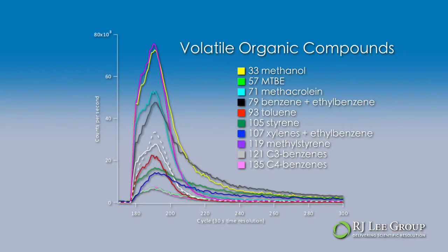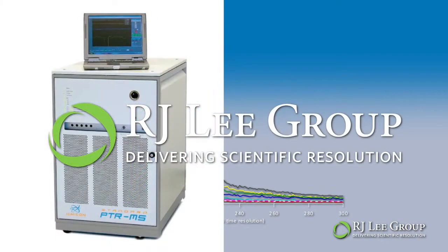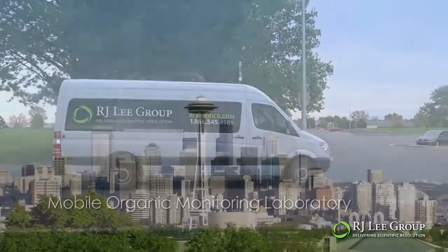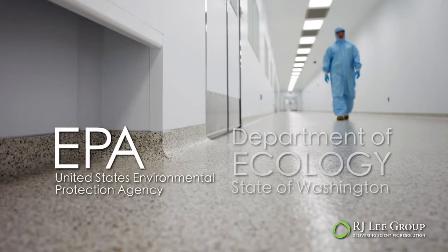To identify and measure volatile organic compounds, R.J. Lee Group has combined state-of-the-art trace gas detection instrumentation with a commercial van to create the Mobile Organic Monitoring Laboratory. This transportable laboratory can screen the air quality of outdoor and indoor environments that must meet federal or state regulations for minimum levels of VOC concentrations and other airborne contamination.